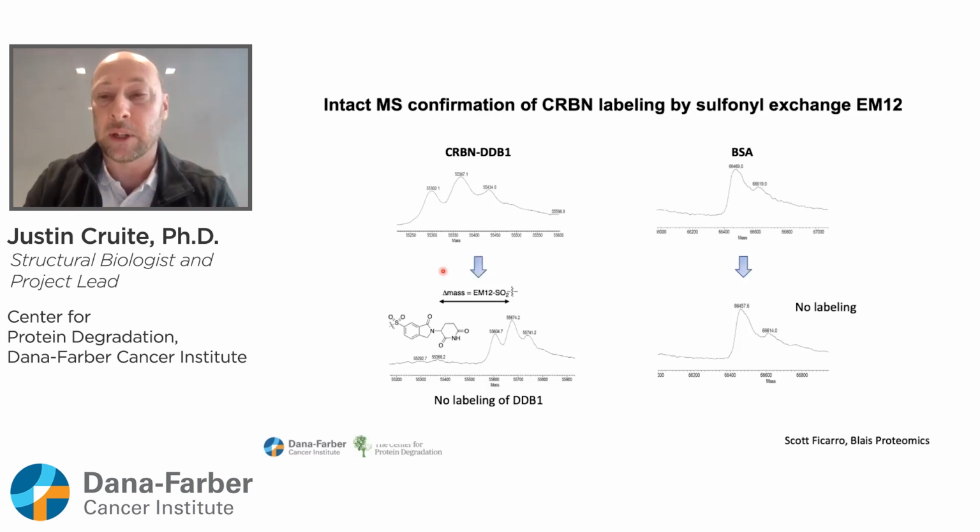We also wanted to confirm that they do covalently label cereblon. So for this, we incubated purified cereblon DDB1 complex with an equimolar concentration of our covalent probes. We incubated overnight, and then we collaborated with the mass spec core here at Dana-Farber, and we showed that there is a nice shift in the intact mass of cereblon when incubated with the sulfonyl fluoride probe, and we see no labeling of BSA or DDB1, confirming that we are specifically covalently labeling cereblon.